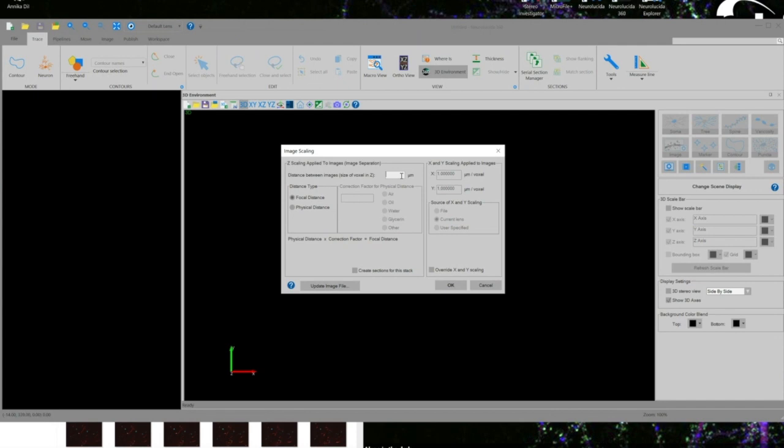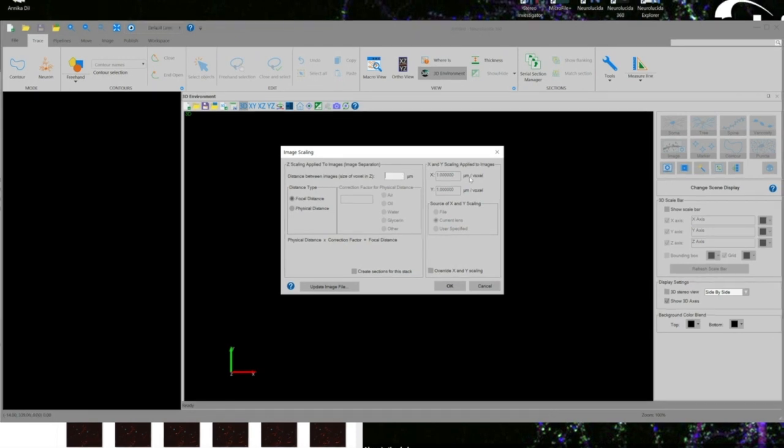This is our image scaling dialog box where we are going to input all of the information we got from our text file including the scaling information for the z, x, and y dimensions.